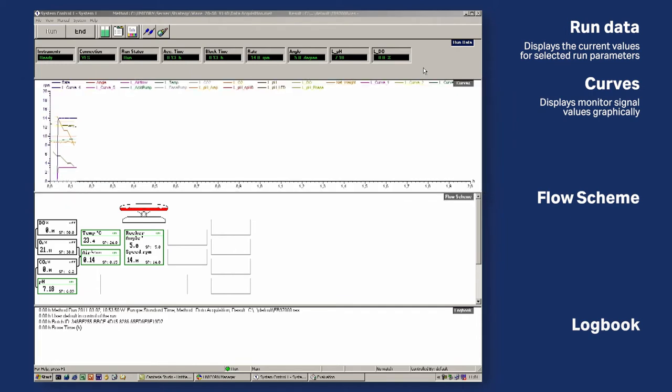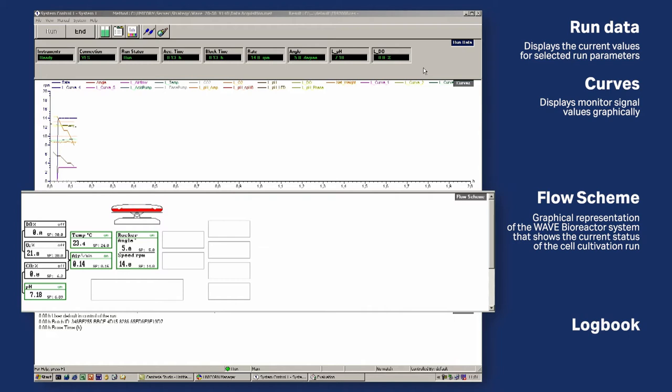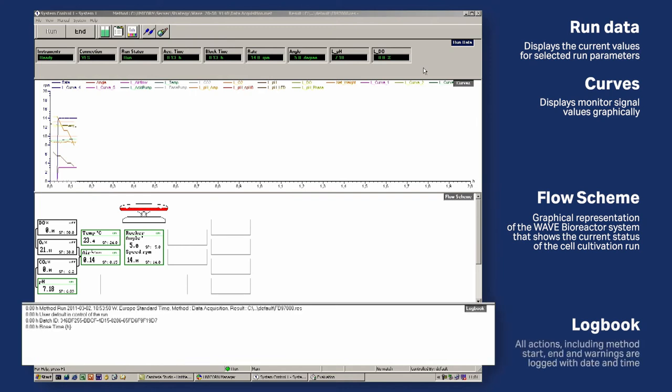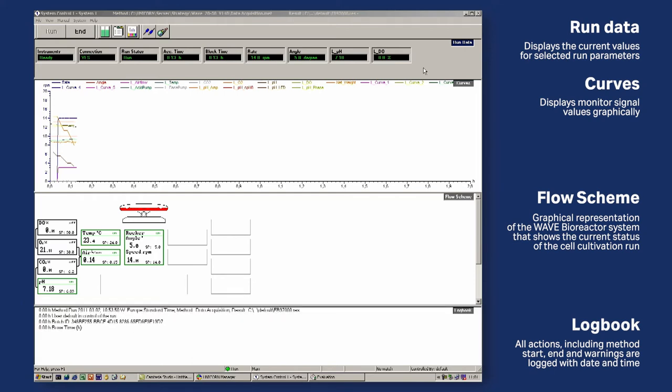The Flow Scheme is a graphical representation of the wave bioreactor system that shows the current status of the cell cultivation run. All actions, including Method Start and End and Warnings, are logged in the Logbook pane with date and time.